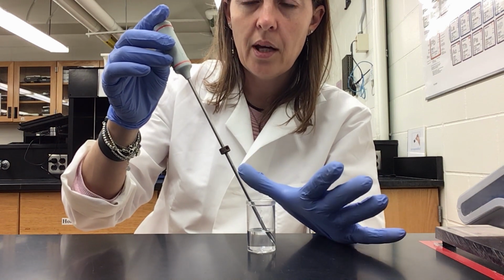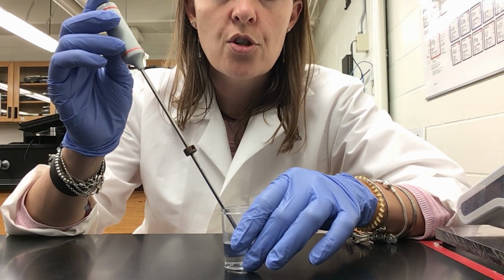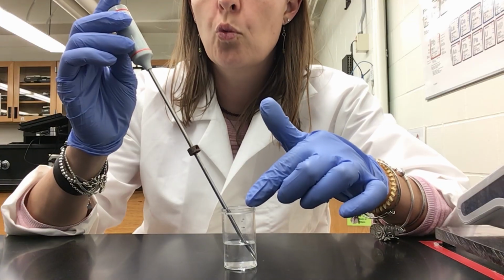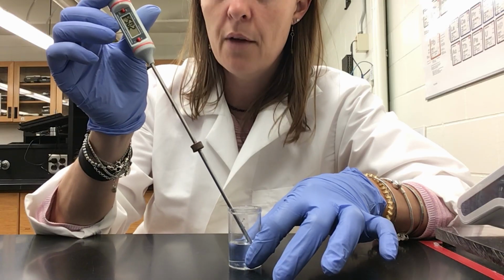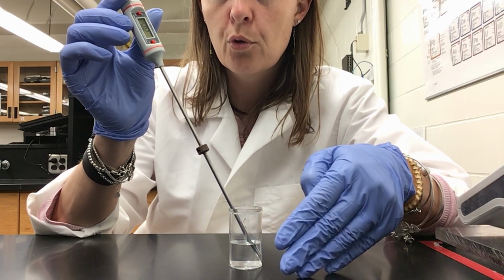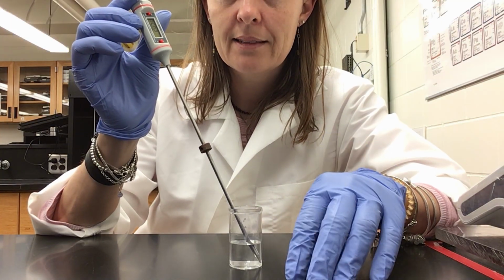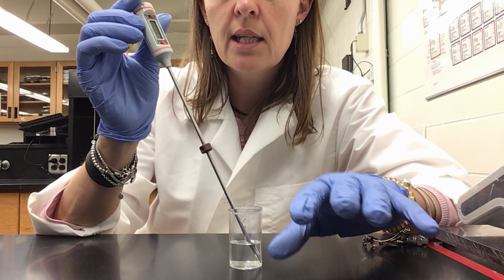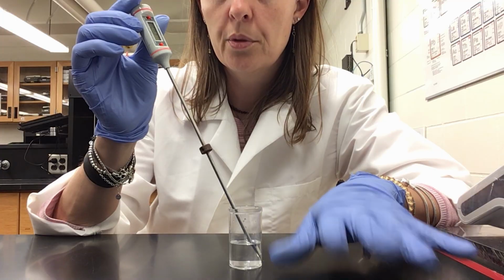In this case, okay, please be considerate that the temperature of the labs changes day by day and with seasons. So don't just assume that the temperature of your water is always the same as the room, okay? So you actually need to measure it every single time. So you measure the temperature of each of the 10 milliliters of water that you measured within the different trials, and you will note it on your notebook, because the temperature will actually be important for the calculation of the volume of your water.